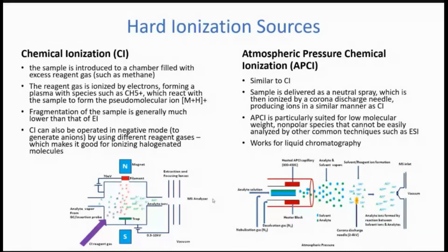So this one kind of looks a little bit like ICP-MS mixed with some of the concepts that you would have for chemical ionization. So you vaporize your sample with a hot neutral gas like nitrogen, and this gets your liquid sample into a gaseous vapor, and you're going to have both solvent and analyte molecules in that vapor.